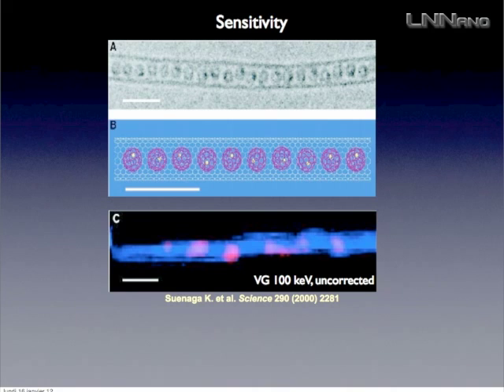You have in magenta a color code for the gadolinium atoms. In blue, you have the carbon. This is an EELS signal that has been analyzed in some way. And the distance between these two atoms is maybe 4 or 6 angstrom, I can't remember, but this is not the point. The point is that these are individual atoms.